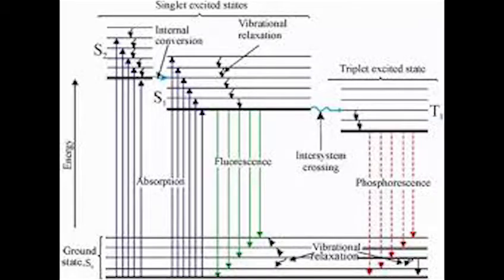The transition of electronic state of a molecule during the fluorescence phenomenon can be explained by using the Jablonski diagram. When UV radiation is present, the molecule will absorb the photon and excite from the electronic ground state to a higher excited state. After that, the electrons in the molecule undergo internal conversion and vibrational relaxation. As a result, the excess energy of the molecule transfers to a lower vibrational level. Then, the molecule emits a photon from the lower singlet excited state to the singlet ground state in the form of fluorescence.